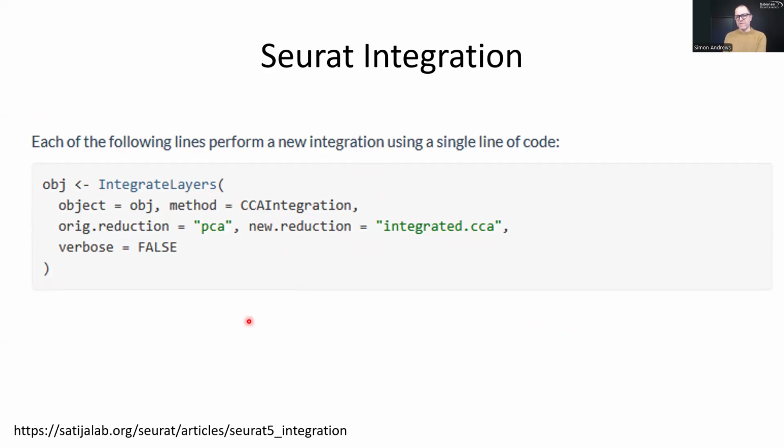But it's also a very black box. You say integrate your data and you don't get much insight into exactly what it has done and the connections that it's made. So that's where we're going to focus today. Not changing our ability to do integration or even the method of integration, but trying to get some insight into how exactly that integration has been performed.